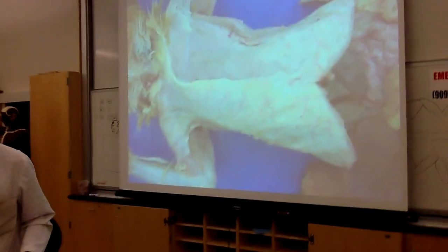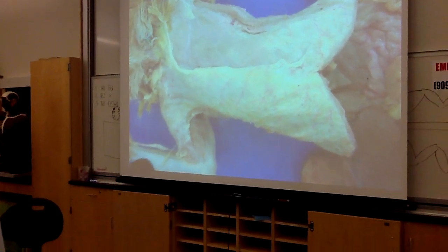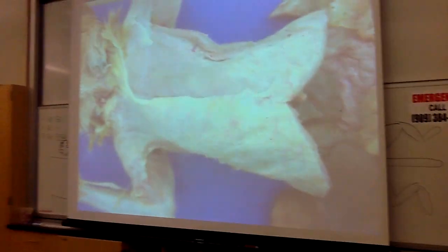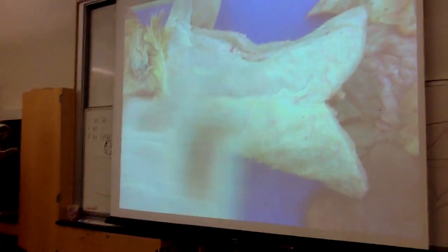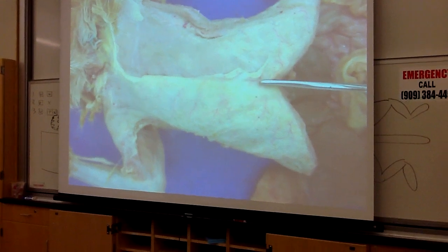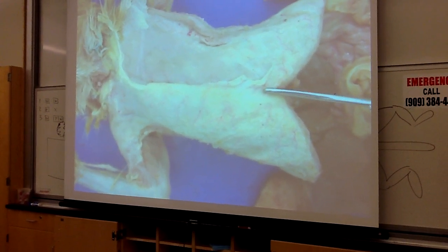Now, you're going to need your scissors again, real quick. This doesn't take too long. Right up here in the chest. Okay? I can see the center of my cat's chest right here. I want to use that as a guide.